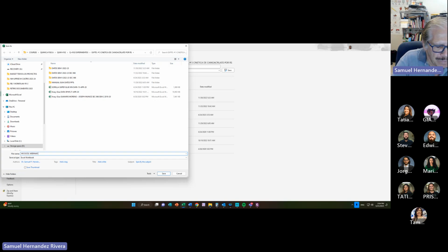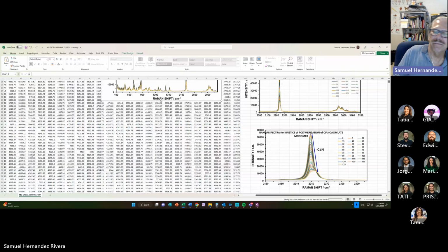I write the year first, 23, dot, the month next, 05, dot, and the day at the end, 23. That's all.